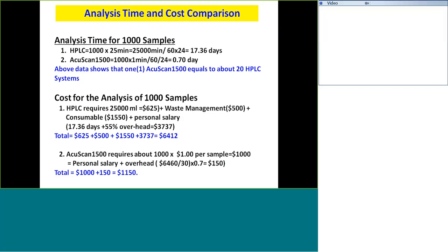Each analysis, if you involve a mass spectrometer, costs you $150 per analysis if you send it to someone to service for you. And if you have it in-house, then you have to maintain the instruments, you have to have expert technicians to run your HPLC and to analyze your data. So all those are very costly propositions.